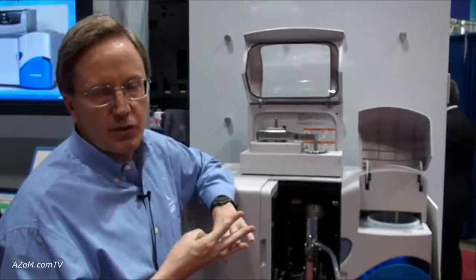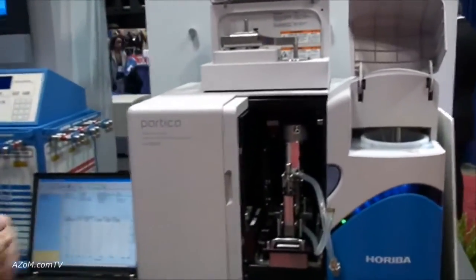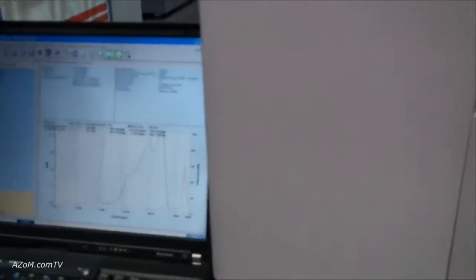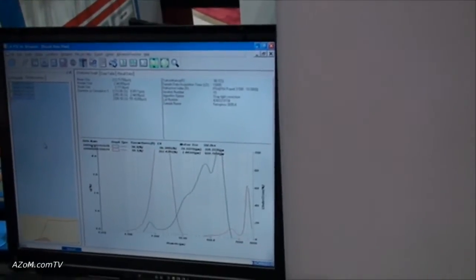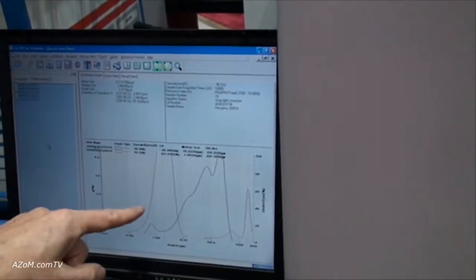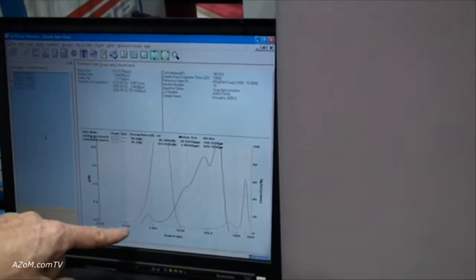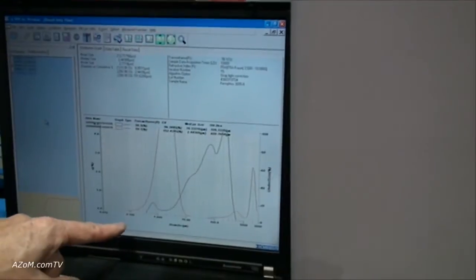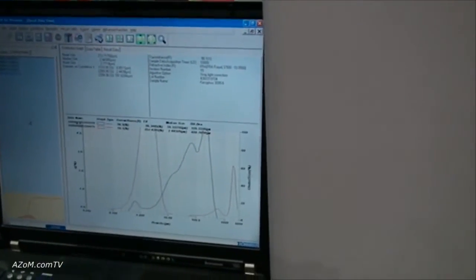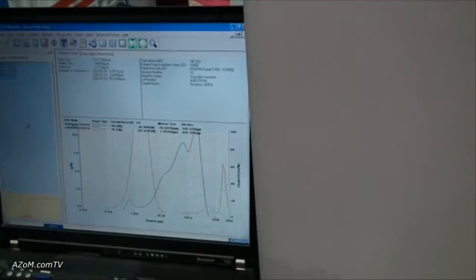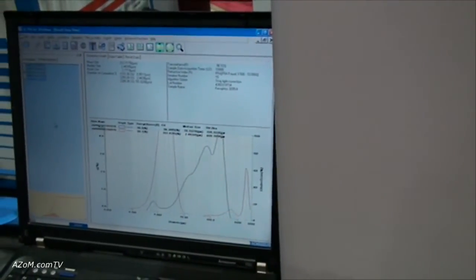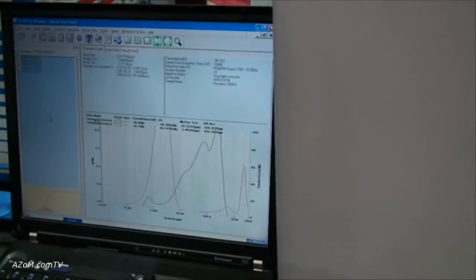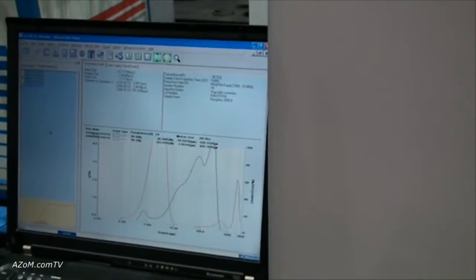What I'm going to show you next on the computer, which is running the system, are two results that show off some of the capability of the instrument. The first result shows a sample with small particles tailing off down to 100 nanometers — that's 0.1 microns. When used to measure particles in liquid suspension, this system can measure particles down to the 30 nanometer scale range, which is actually the smallest size particle measured by a laser diffraction analyzer on the market.